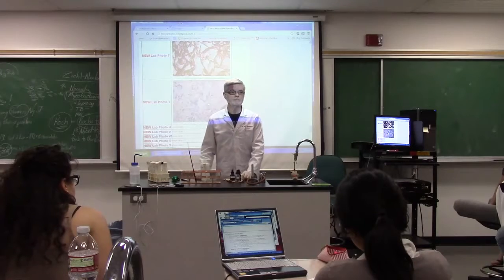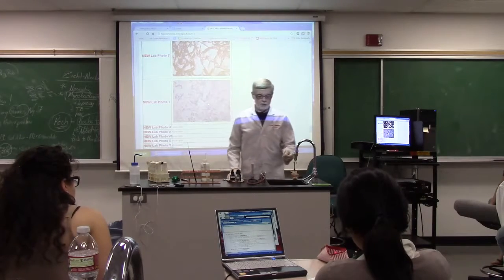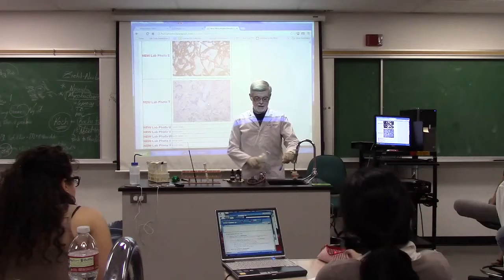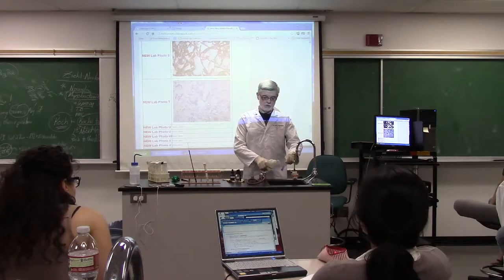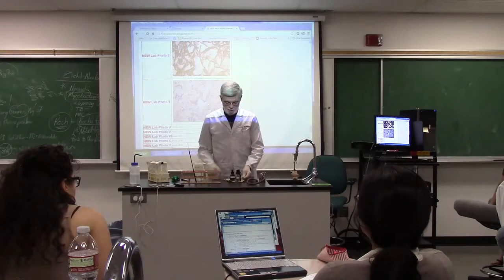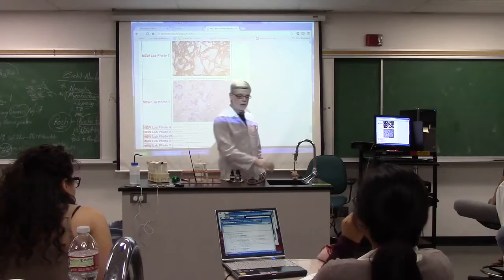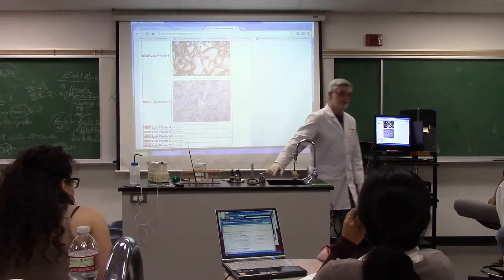Other questions? Okay, I'm going to take my methylene blue and shake it off. I'm not going to overwash, I'm just going to rinse around it and let it dribble down. And then I'm going to fold over and blot that dry. Then I'm going to put oil on it and look at it, and I'll have it up here on the microscope.